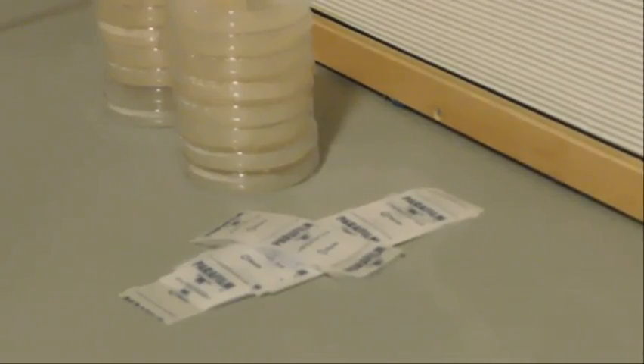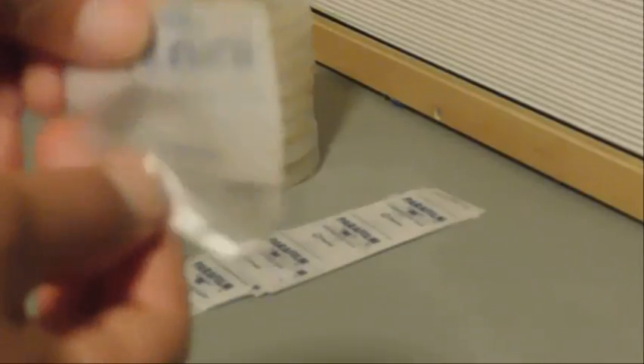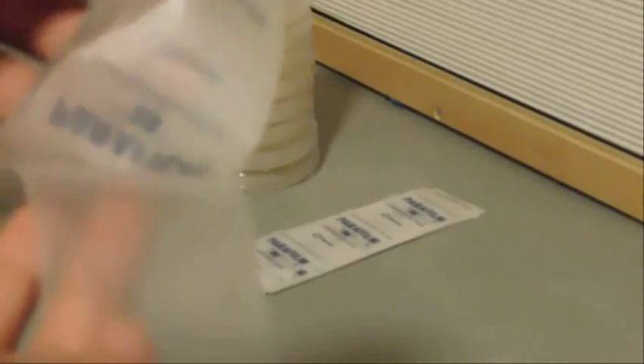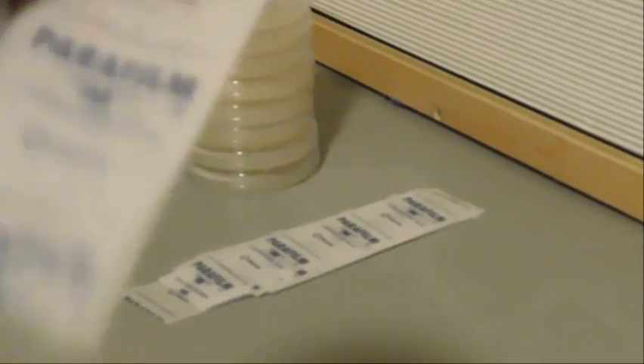The last step is to grab the parafilm. You want to wrap it — first, take the little plastic off. It comes in two pieces. Take the plastic part and stretch it over the petri dish and wrap it around. It should look like this when it's done.